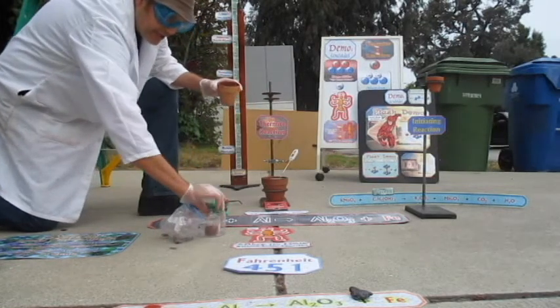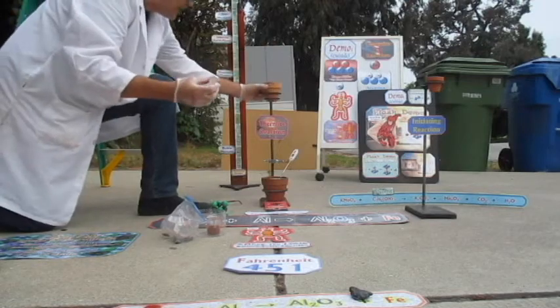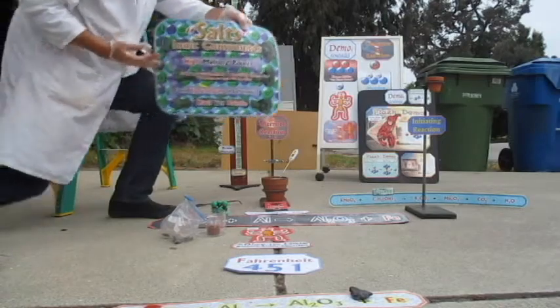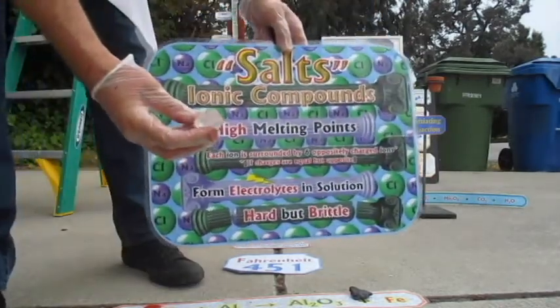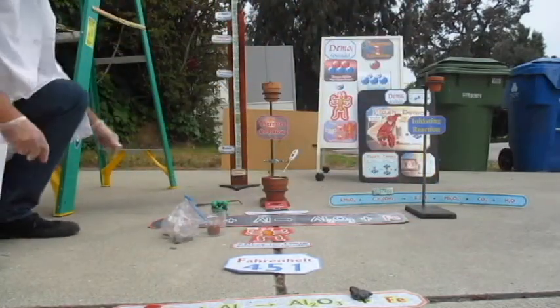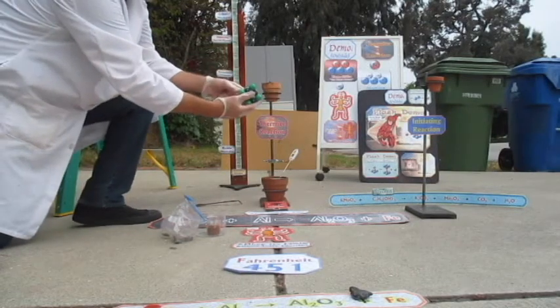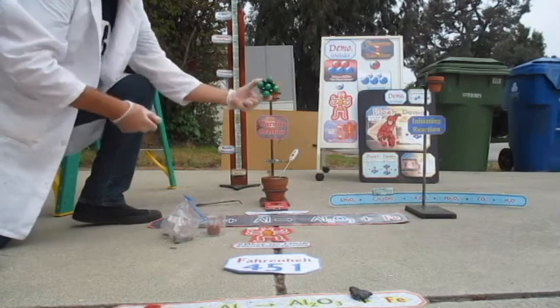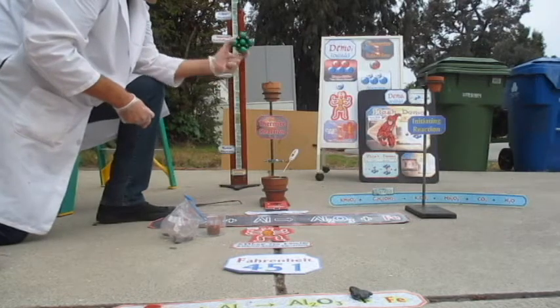We're gonna do a few neat tricks in here. One of them is we're gonna try to melt an ionic compound. Remember, ionic compounds or salts are very hard to melt. Here's one, this little cube here. It's very hard to melt because of the ionic compound structure. You can shake them and shake them, they're really not going anywhere. It takes about 800 degrees Celsius to melt these, which is like 1,500 Fahrenheit.